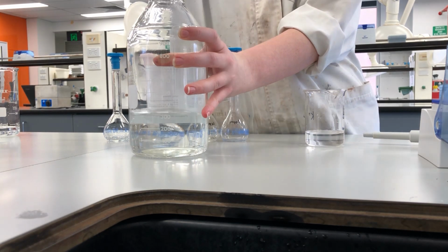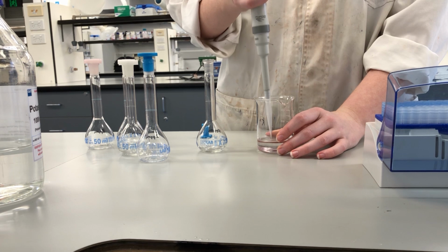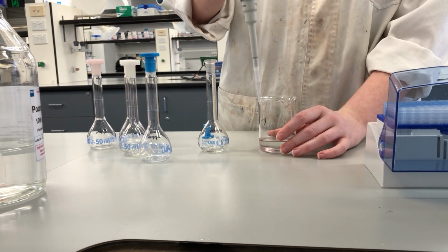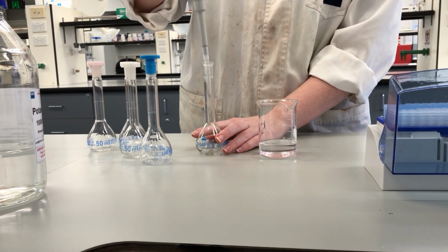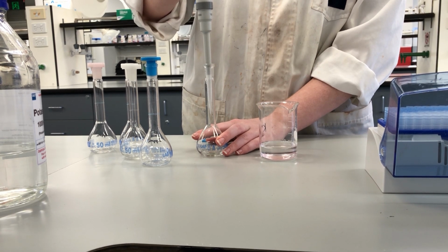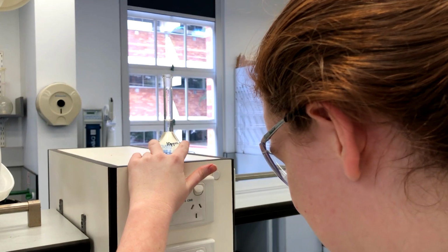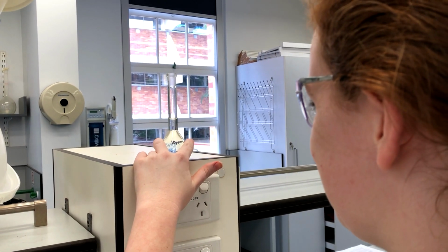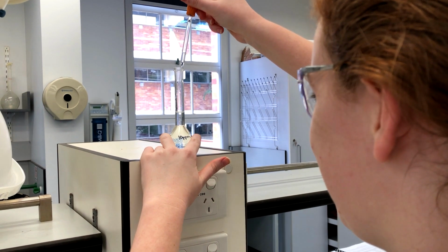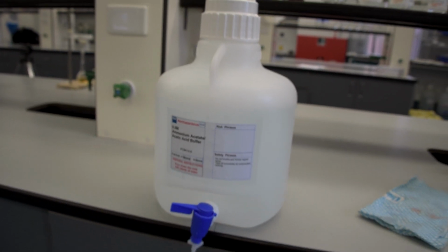A series of standards in 50 ml Class A volumetric flasks was made. A volume of 1000 ppm potassium standard was pipetted using an auto pipetter which was calibrated in the previous practical. Volumes of 0, 0.1, 0.2, 0.3, 0.4 and 0.5 mL were pipetted into the 50 ml flasks and diluted up to the mark using the ammonium acetate acetic acid buffer. As with the previous practical, by ensuring we are using the same diluent in our sample and standards, we are ensuring they are matrix matched as best as we can.